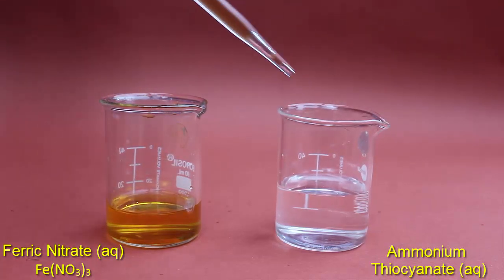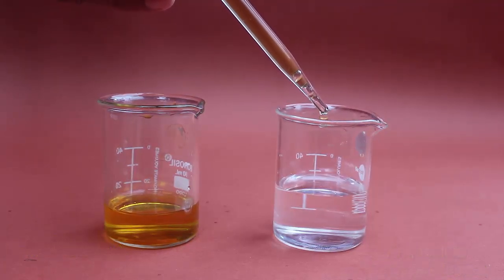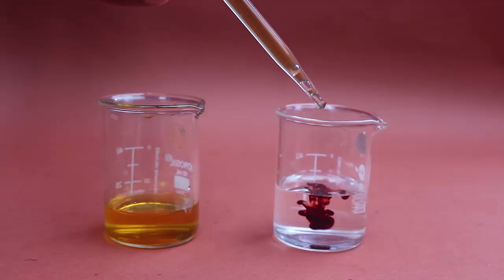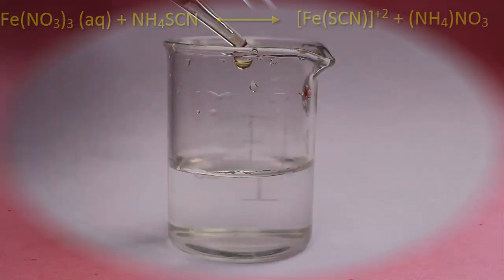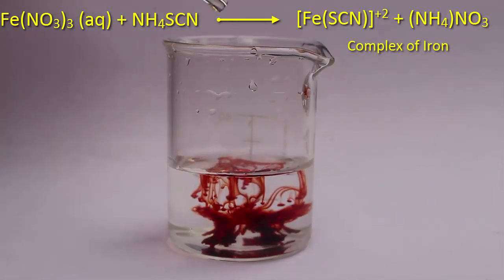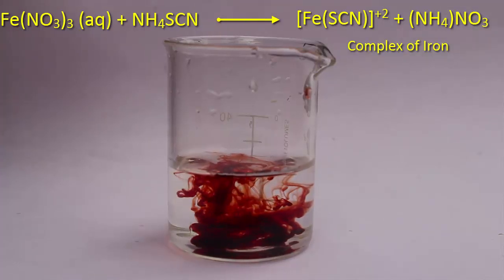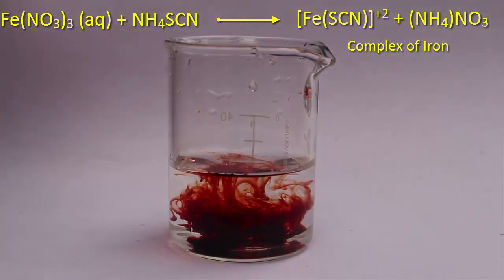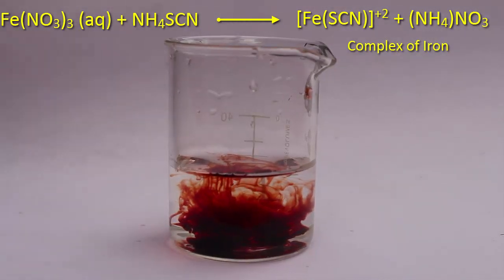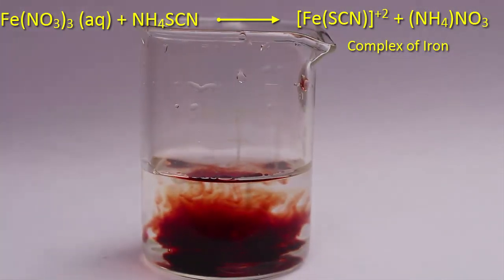Using a dropper, we are adding the ferric nitrate solution into the ammonium thiocyanate. Let's see what happens. Now we are adding another drop of the solution — the color is spreading, and we can see a beautiful red color coming out. We can compare the color with our blood.